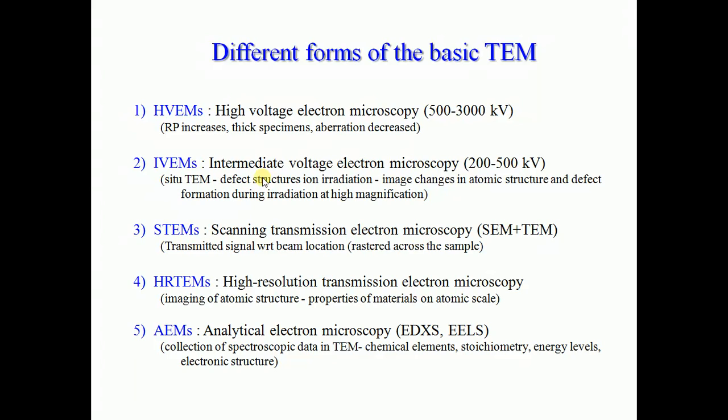We have analytical electron microscopy, where we do elemental analysis in TEM, like EDAX and EELS, electron energy loss spectroscopy. So this is in TEM. These also are the different types of TEM.